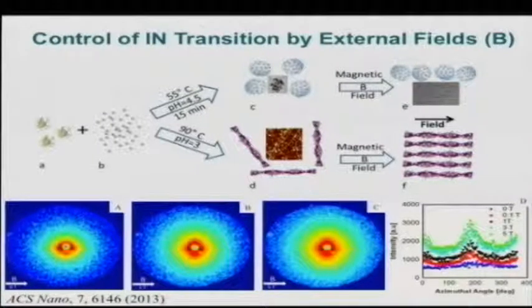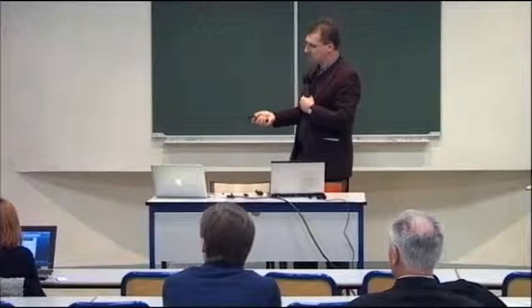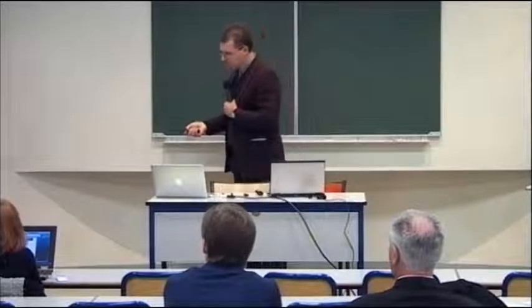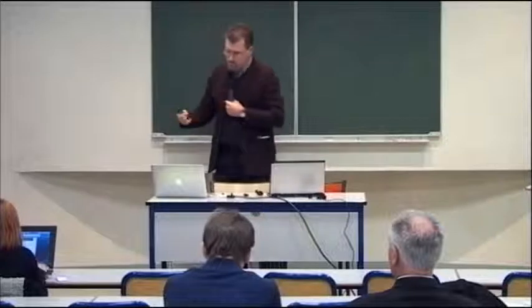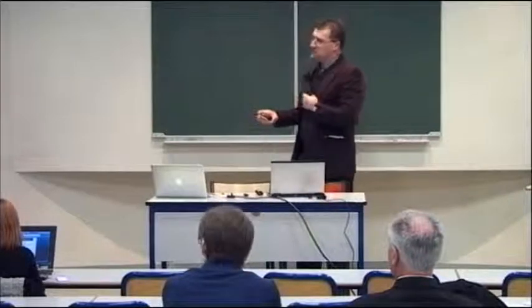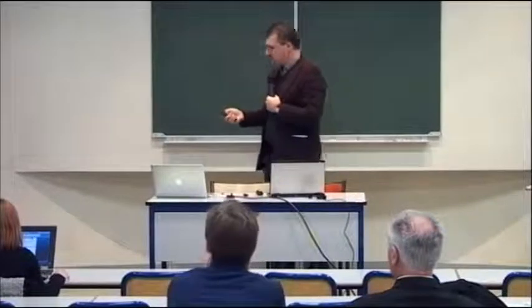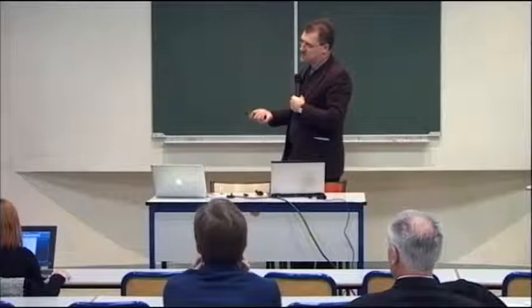So of course we've been doing that at very low content of fiber to be as close as possible to the isotropic phase. And from that you can actually extract the order parameter, which I showed you in the previous slide, which can be useful to look into the osmotic compressibility of the system. So just to convince you that you can use microscopy and scattering also to look into application of this system.